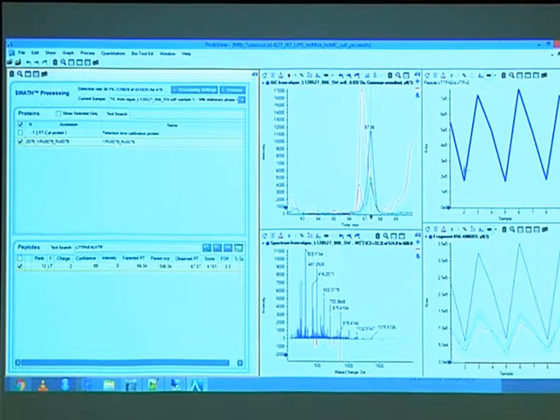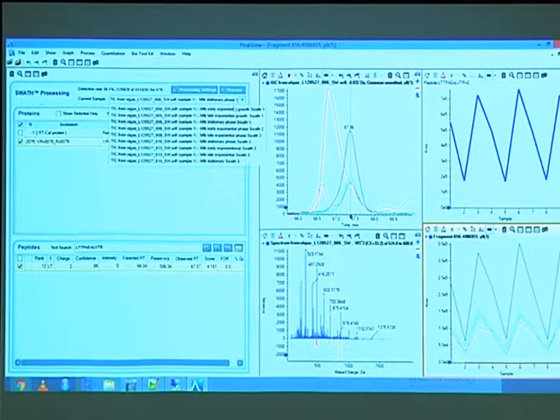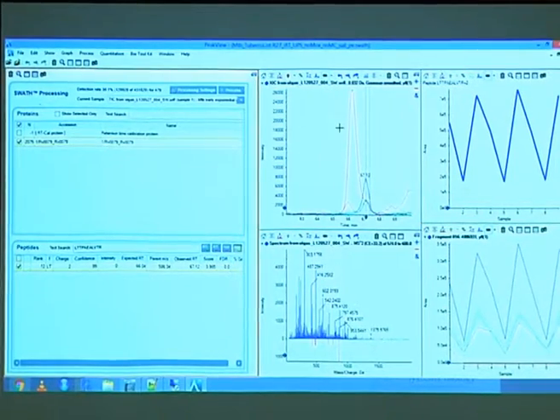So in that case, it looks okay from that perspective here, but you already see that here the intensity of that peak might give you trouble. You also see that if you look at the fragment ion area information across samples, it goes just down to 0, pretty much. What happened there? Oh, I was at number 3, I think.